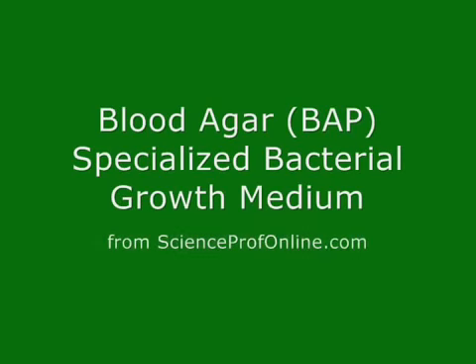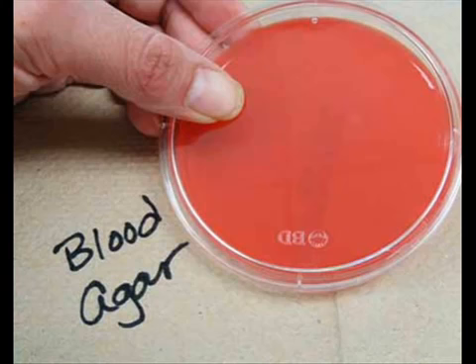In this video, I'm going to show you how to interpret blood agar bacterial growth medium. This is a sterile plate of blood agar.